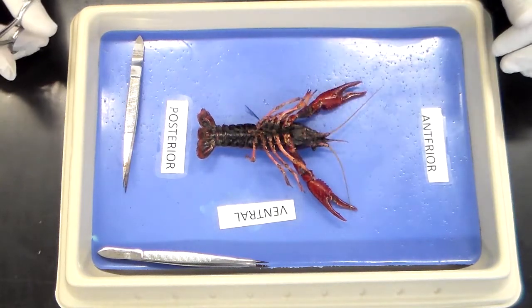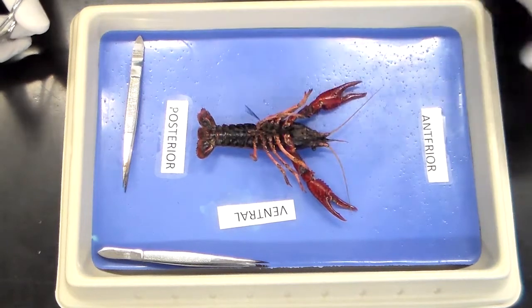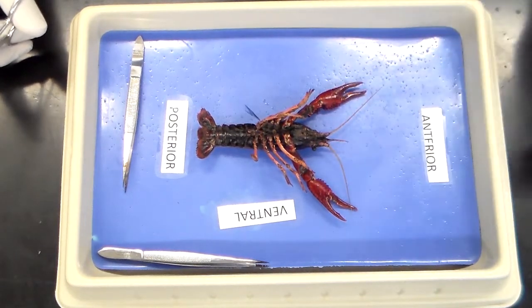The first thing you're going to do is sex your specimen. I noticed the modified swimmerets here, so I can tell that this is going to be a male.